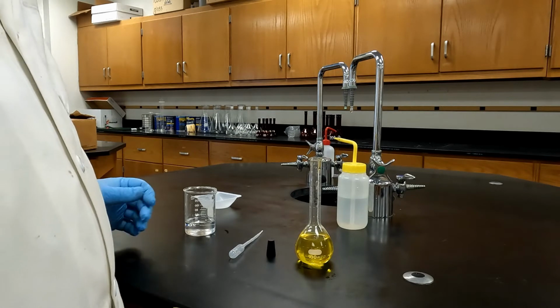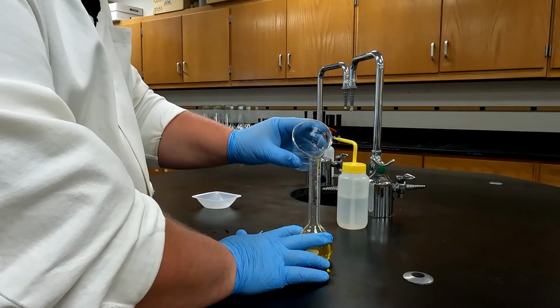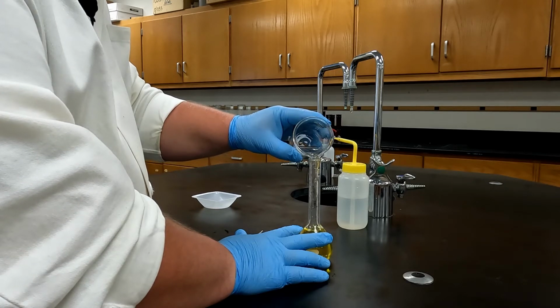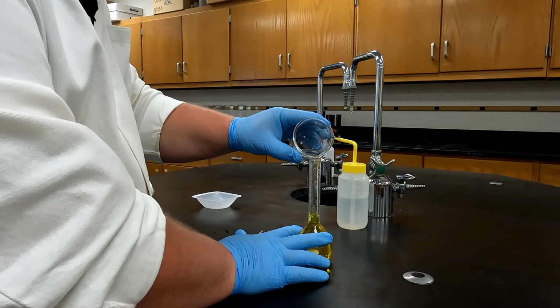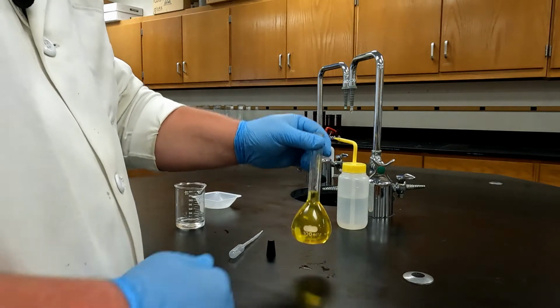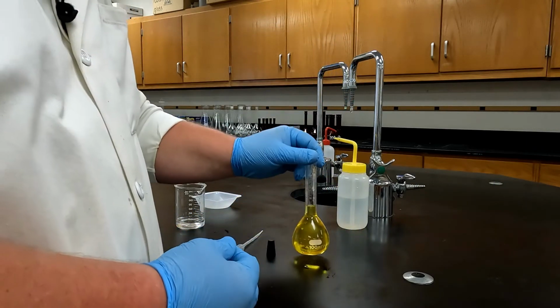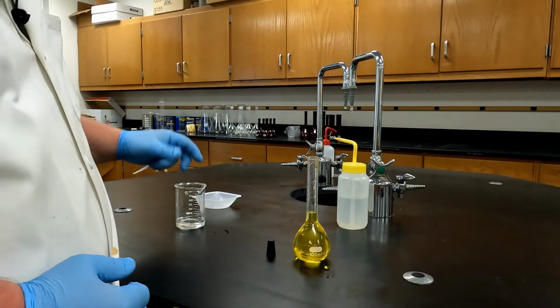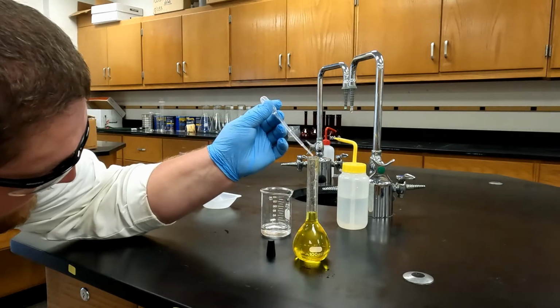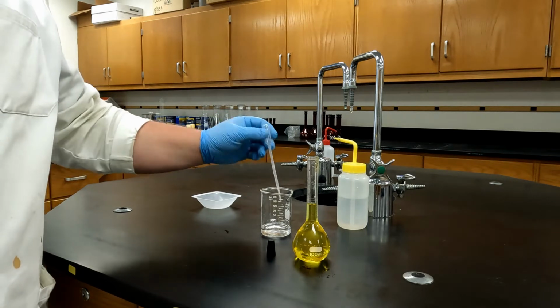Once I have all of the solid dissolved, I'm going to continue filling the flask until the water level reaches the neck. Once the water level reaches the neck, I need to go a lot slower. I'm going to use this line here as my full line. So I'm going to use my barrel pipette, fill it up, and I'm going to slowly add water until the meniscus is directly on that line.